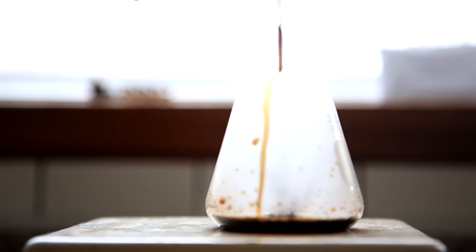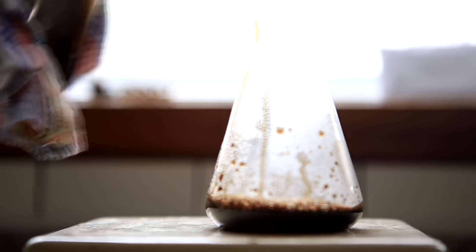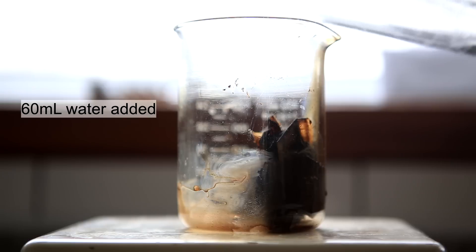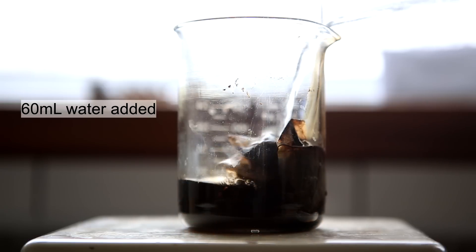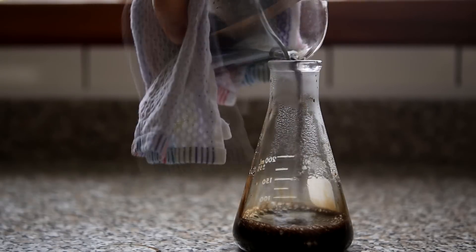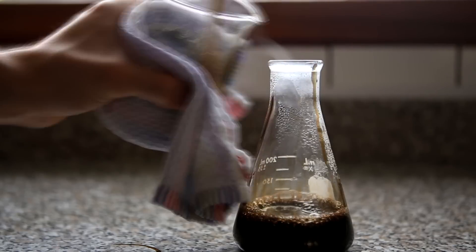After 10 minutes the concentrated tea extract was transferred to an Erlenmeyer flask. The tea bags were pressed in order to release as much water as possible, which was then also decanted into the Erlenmeyer flask. Now 60 milliliters of water was added and the process was repeated. The tea extract was combined with the previous extract and again the tea bags were squished to release as much water as possible.